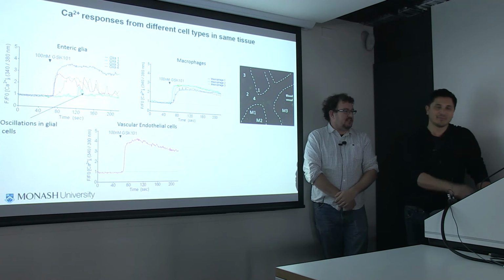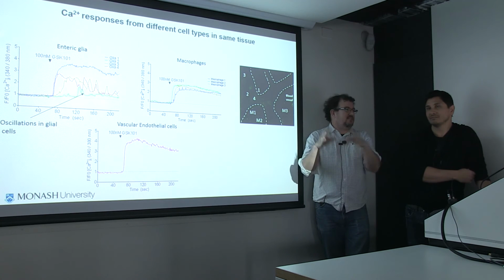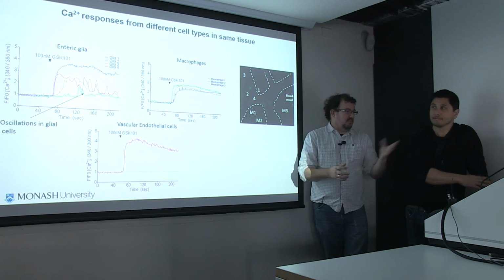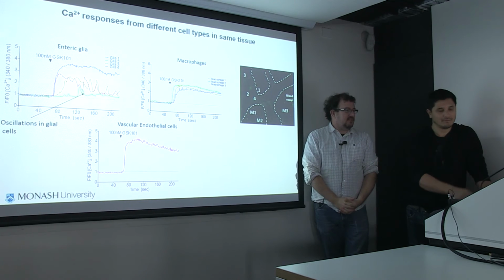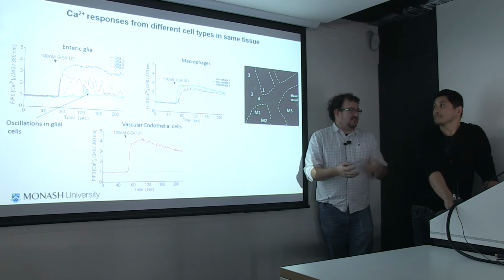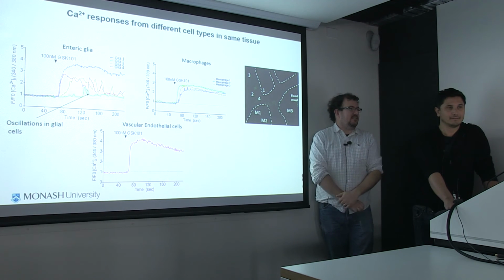I guess part of the other question is too, do you get a certain type of response if cell type A or B is within a certain area of it only, or does it happen no matter what? We can mark all these cells out and get all the information about each cell without a problem. But it's more that it's complex, not just a single cell type, but multiple cell types and multiple locations and everything else.